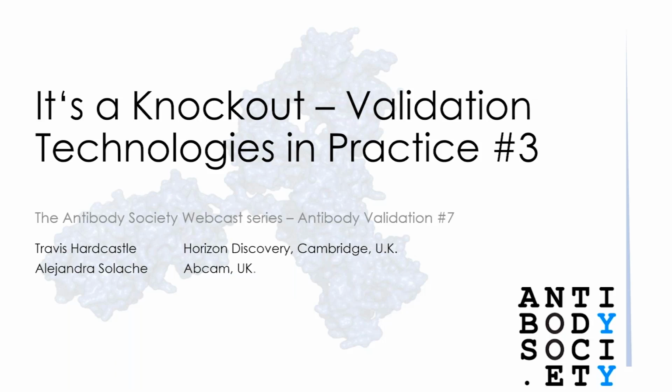You may be able to buy or make an appropriate recombinant protein for Western blot, ELISA, or IP validation, but of course that isn't always possible. But for specific cellular expression, or for expression in animal tissues, the options are more limited. One of the most useful technologies is to specifically ablate the expression of the target protein in the cell or tissue of interest. This is not a technology that every lab has mastered and takes much time and resource.